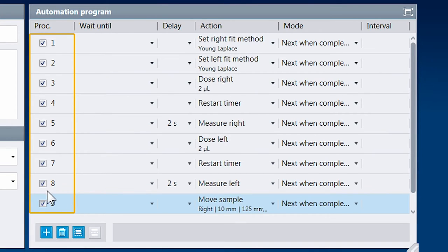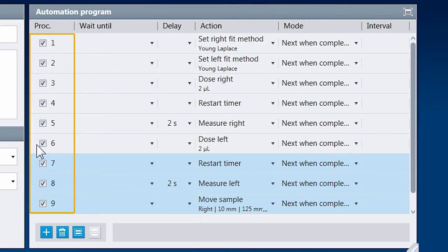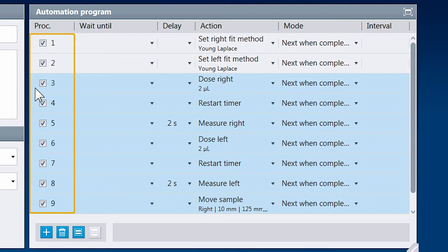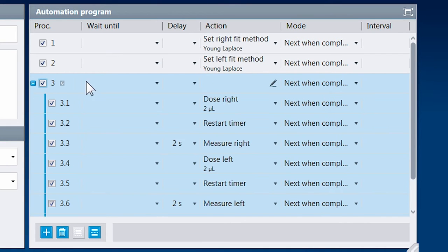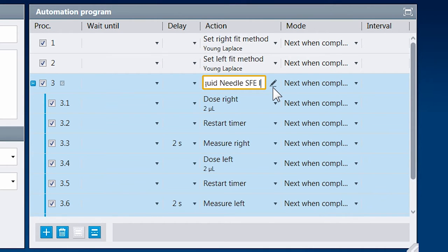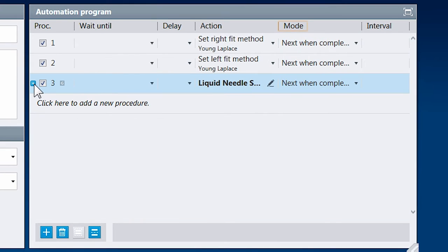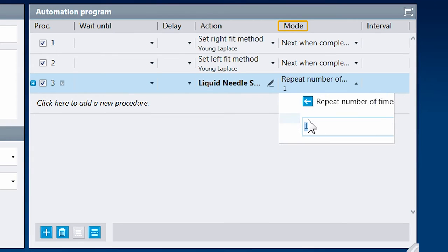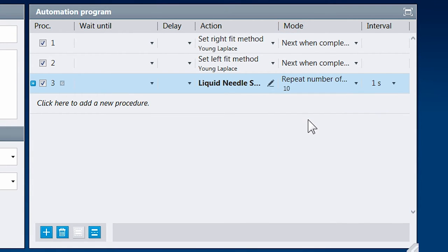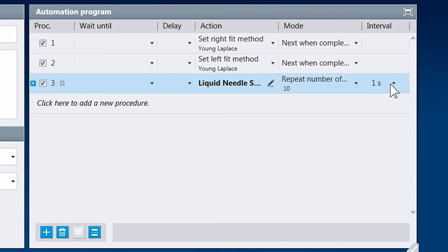The group can be named for better readability. Now setting the execution mode will affect the whole group, and we can define a certain number of repetitions. The time between those repetitions can be set with the interval.